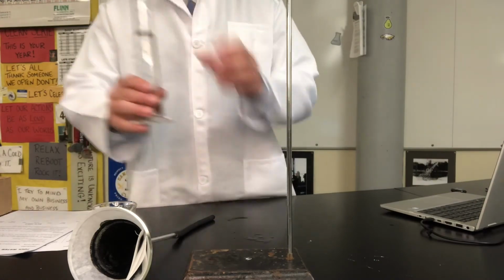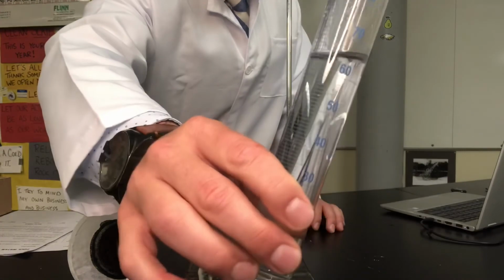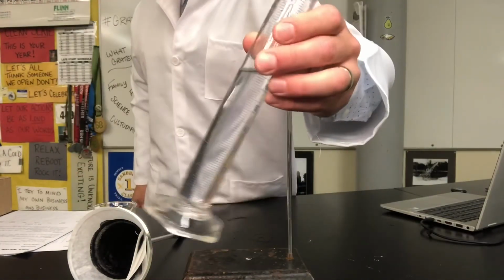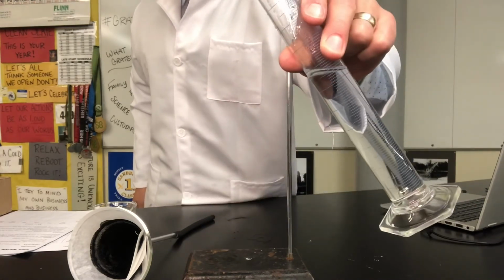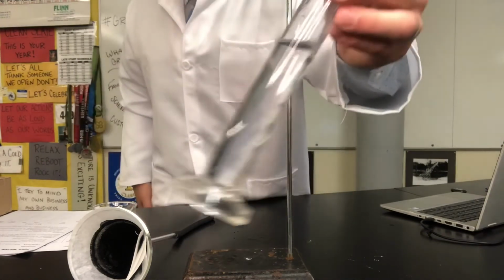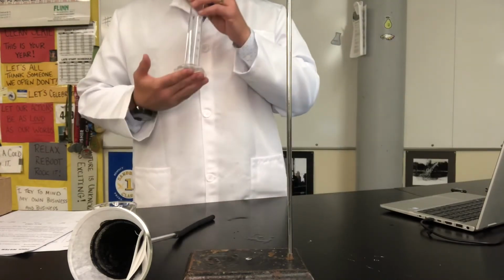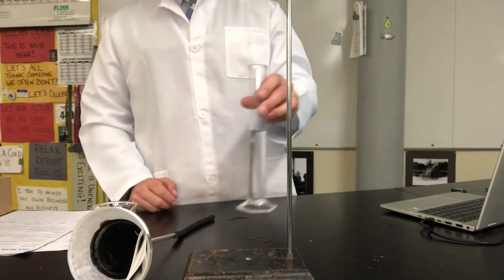Let's take a look at that color. No longer cloudy, brown, or yellow. That's a nice clear color, right? Also clarity. No longer yellow or brown for clarity. This is nice and clear. So clarity is clear, all right? Not cloudy. Odor. There's actually no smell left to it. The charcoal did a great job of removing the smell. There's no oil in it. It's nice and clear, and there's no solids either. So this is nice and clean.